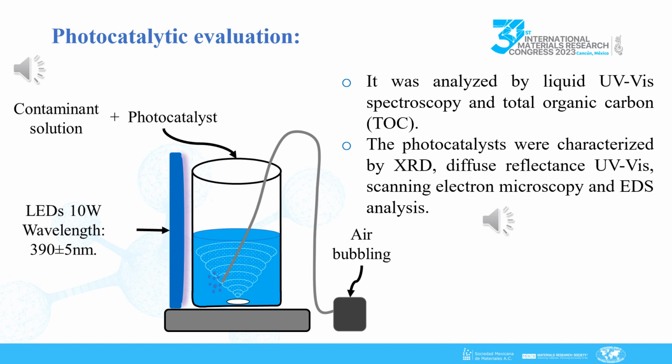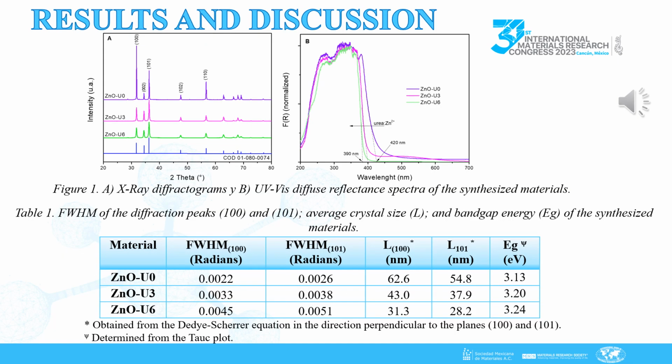The photocatalysts were characterized by X-ray diffraction, ultraviolet visible diffuse reflectance, scanning electron microscopy, and energy dispersive X-ray analysis. Figure 1 shows the X-ray diffractograms and the ultraviolet visible diffuse reflectance spectra of the synthesized materials.